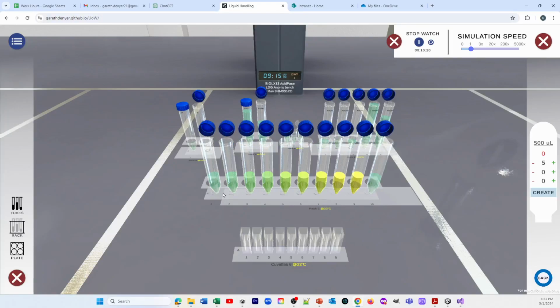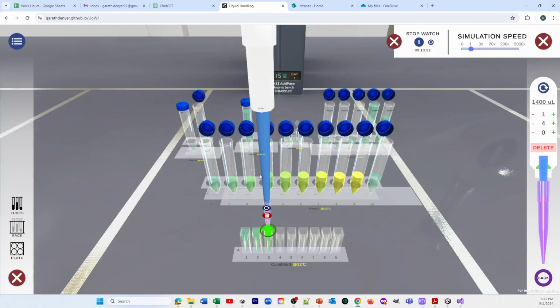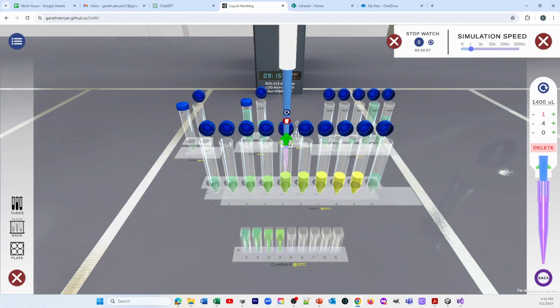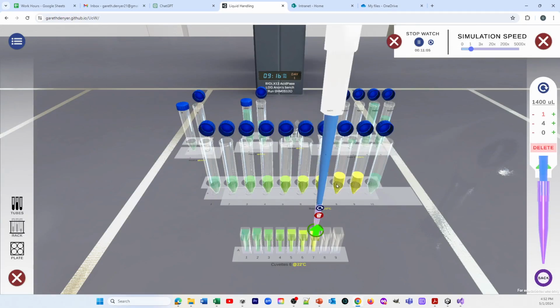And it's really important that I don't sample from anything that isn't. That's a complete disaster if that. Now remember, the volume that we want to put in a cuvette is 1.4. So let's suck up 1.4, put it into there, 1.4, put it into there. And again, in your particular live prac, you'll be doing this by pouring or by using some other method to get the solutions into the cuvettes.